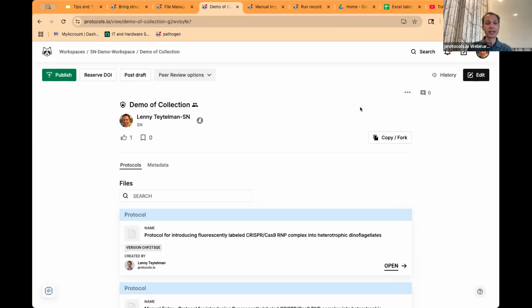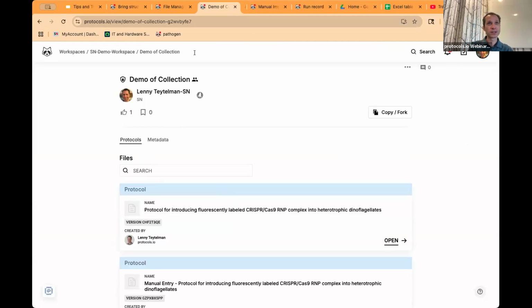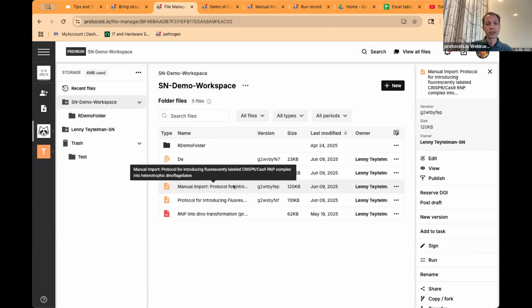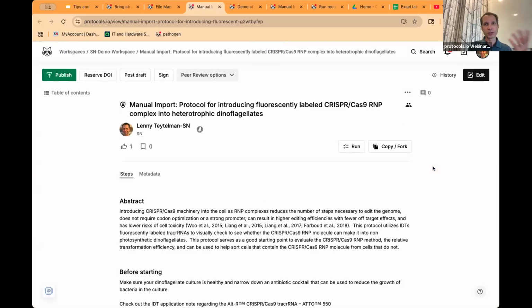Now, one of the questions that we frequently get and we cover on this webinar is, when you're looking at an individual protocol, what is the difference between forking and copying? So if you've heard the intro webinar to Protocols.io, you will know that every one of the public protocols or private ones that you find on Protocols.io is a template and there is a prominent copy fork button on it.